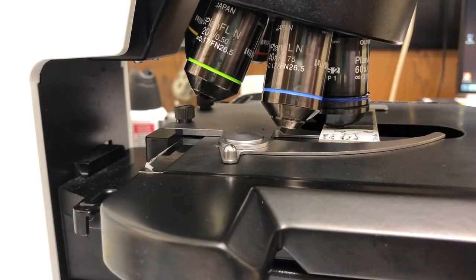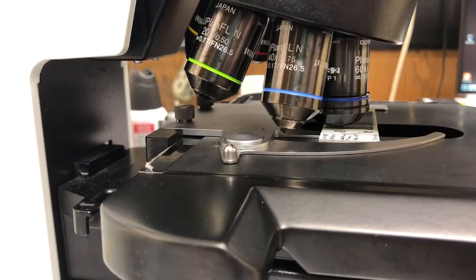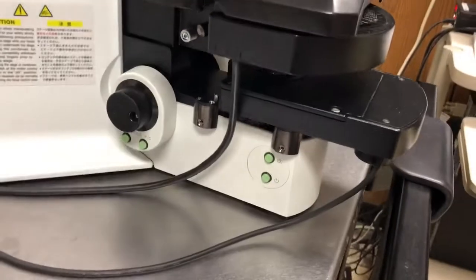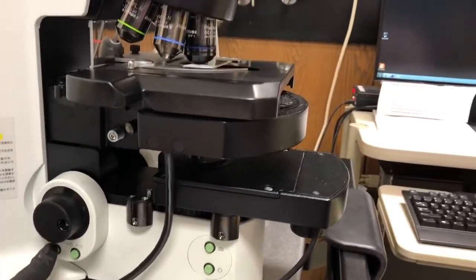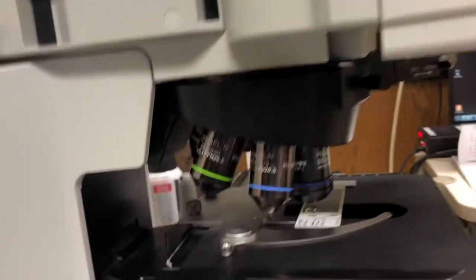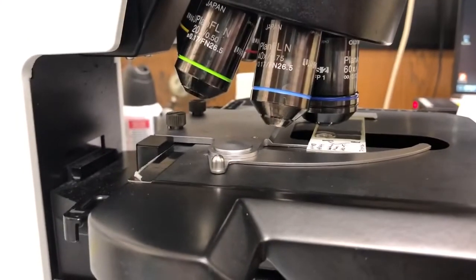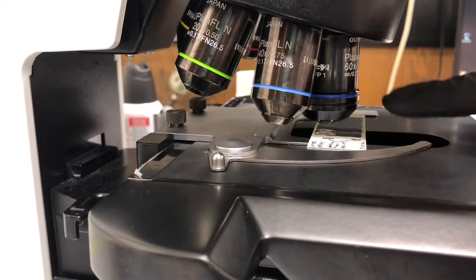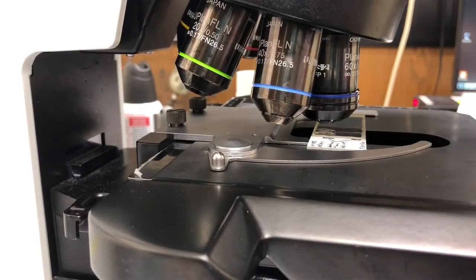Okay so I'm done with imaging. What we need to do now is to safely remove our sample and clean the objective. To safely remove our sample again we're going to hit that escape button down here. That will move the sample away from the objective. We always want to do this when using an oil objective because we don't want to scrape the objective on the sample or vice versa.